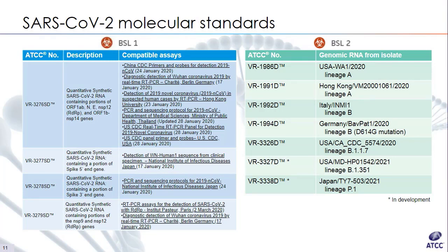So for our thought experiment, let's say that we want to design a multiplex quantitative RT-PCR assay for SARS-CoV-2, influenza A, influenza B, and respiratory syncytial virus. Let's further say that our target for the SARS-CoV-2 portion of the assay is the RNA-dependent RNA polymerase gene.